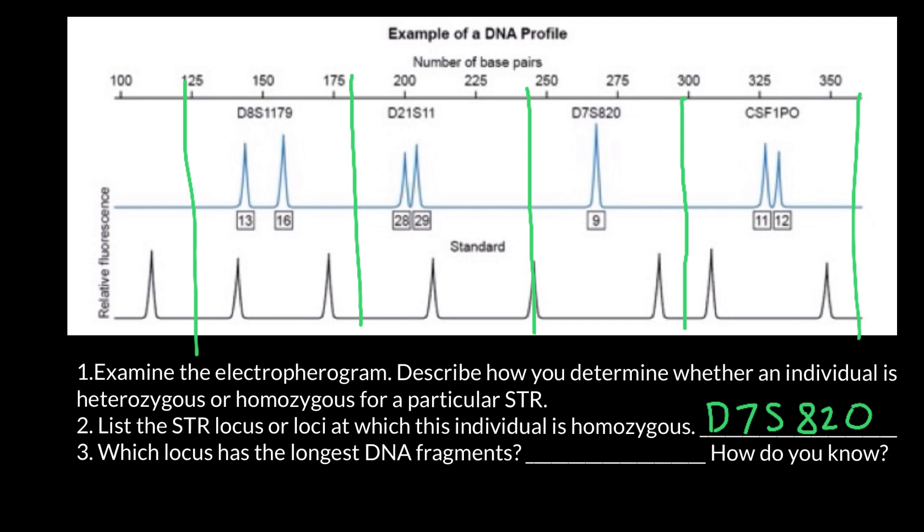Plus, don't forget that we use different pigments for many loci that are close to each other. So we can differentiate them because some of the sizes of the loci would overlap, but in these cases we would use different pigments, for example, green pigment here and red pigment here.